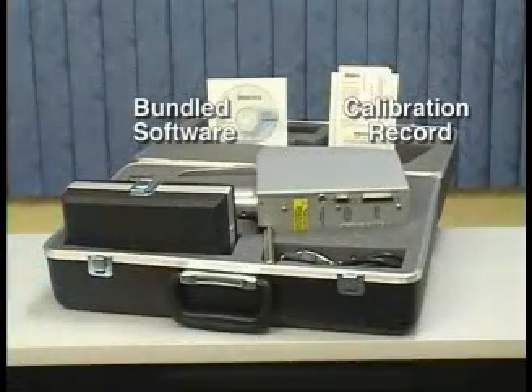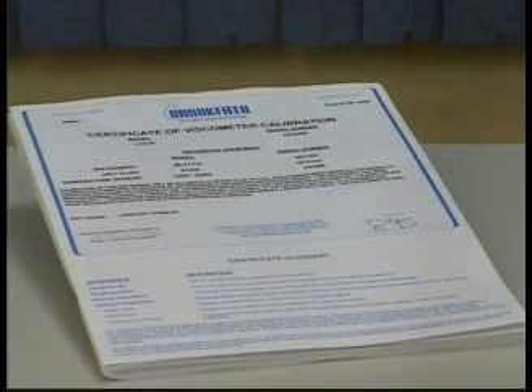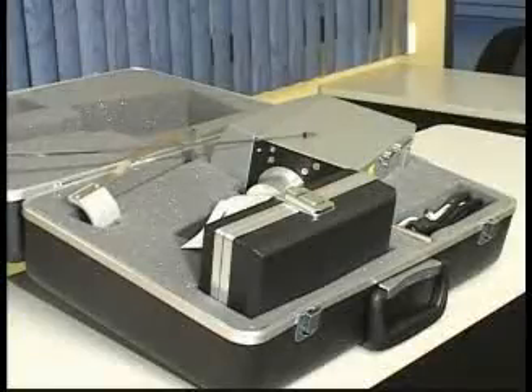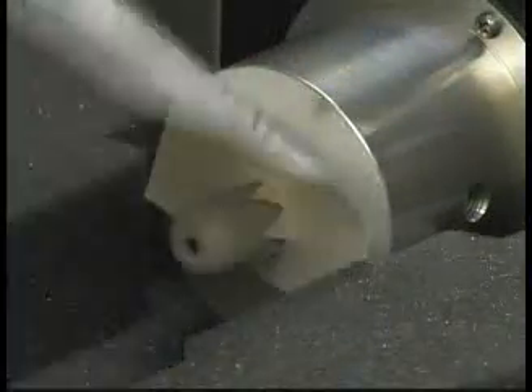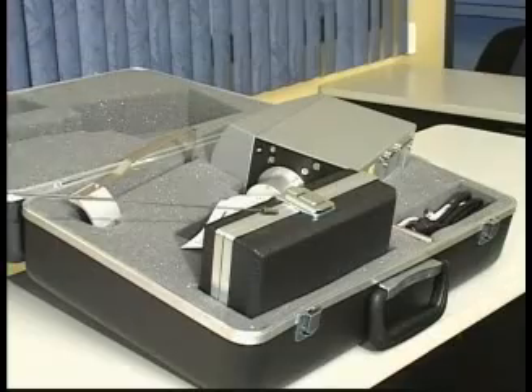Open the carrying case. Inside, there should be a calibration certificate for your viscometer, which certifies measurement accuracy and reliability according to Brookfield's published specifications, a viscometer head with a protective shipping cap in place, a power cord, a spindle set case, and a guard leg.